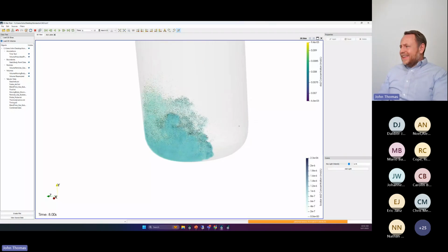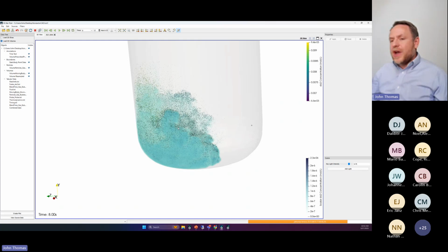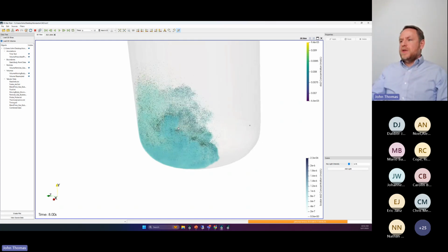And again, guys, this is like my 4th simulation. That's the point of that paper I was referencing earlier. It's absurd what I'm doing live in a webinar on a laptop. I'm running these multi-phase oxygen transfer, blending LES simulations with a million bubbles. It's bonkers. And it's all thanks to the GPU. And if a code can't do that on a GPU, that code isn't designed for GPUs, I'll tell you that much. But when you have a good code that's born and bred to run on GPUs, this becomes your playground.